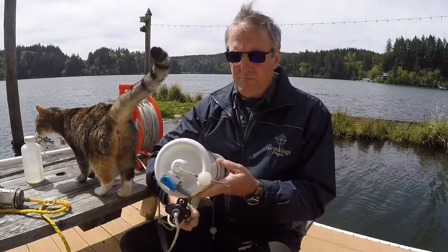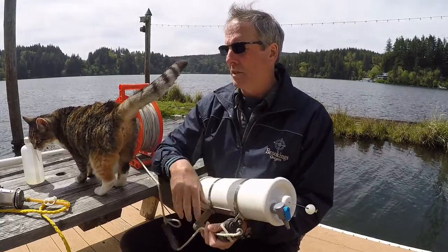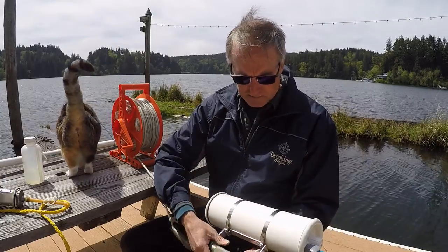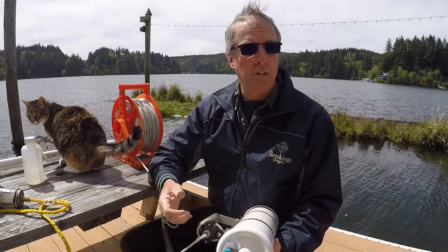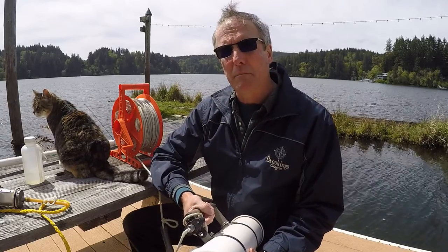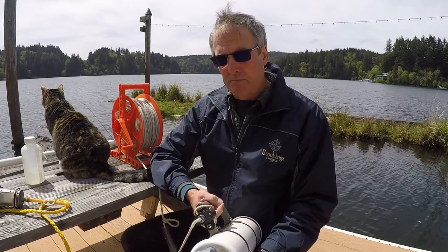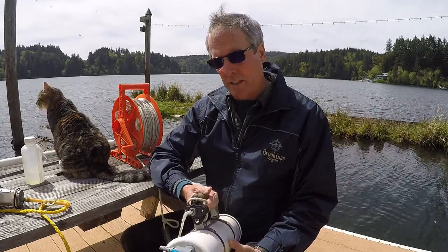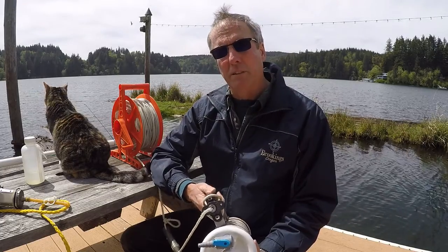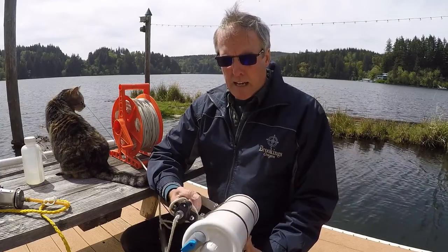So if you think about it, if you take a water sample at the surface, it's usually pretty straightforward. You just have to use a beaker. Depending upon where you want to take the sample exactly, I'll be going over those in a different video, but they're fairly straightforward on the surface. You just have to get to the depth where you want to have the sample done.